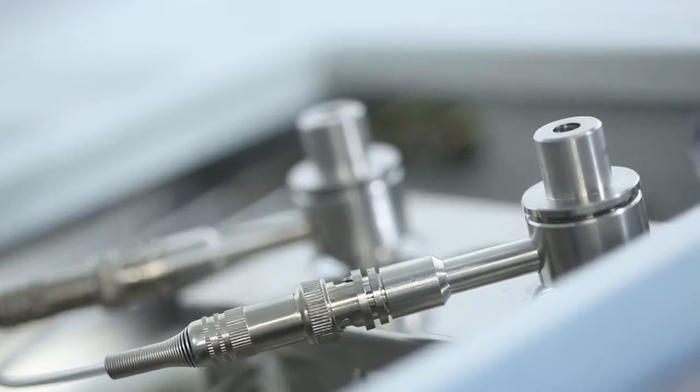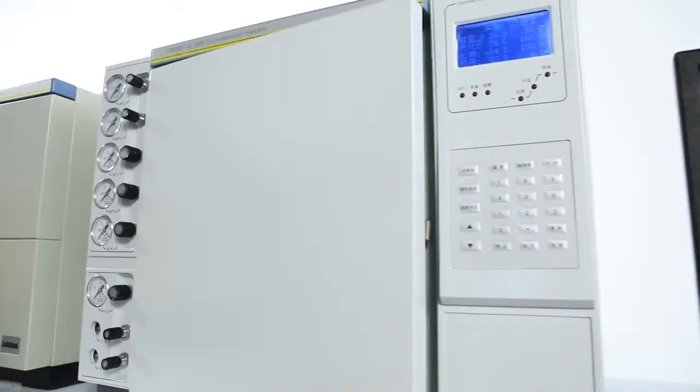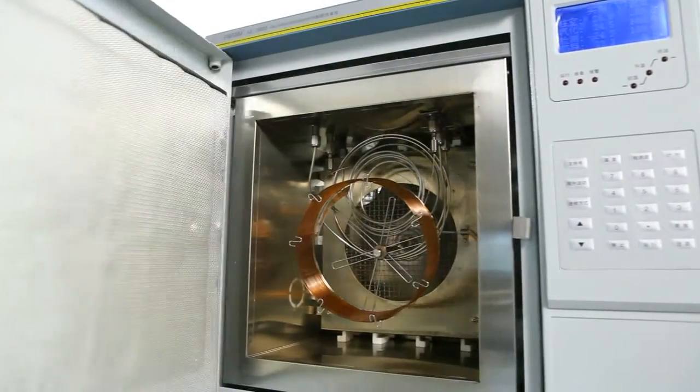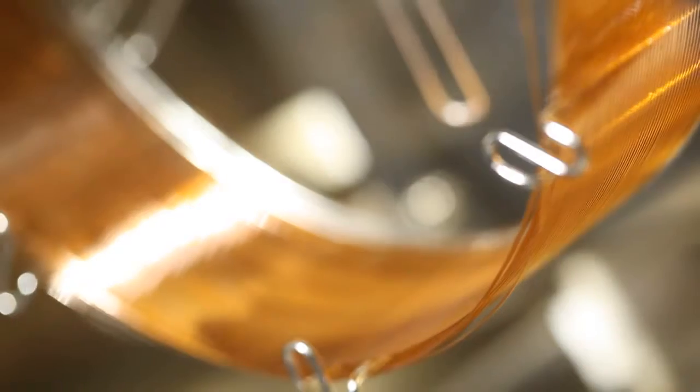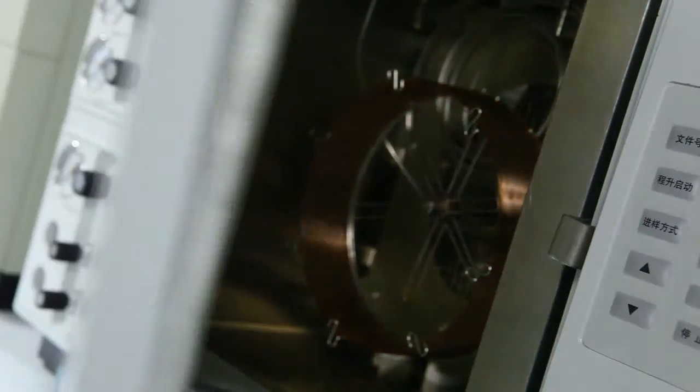The gas chromatograph has both an FID detector and a TCD detector, which are paired with a capillary column and a packed column correspondingly, to test the purity of a particular substance and the relative amounts of such components in a mixture.